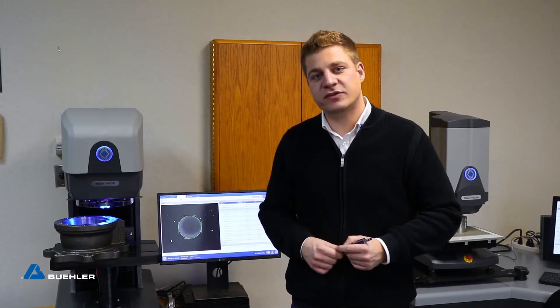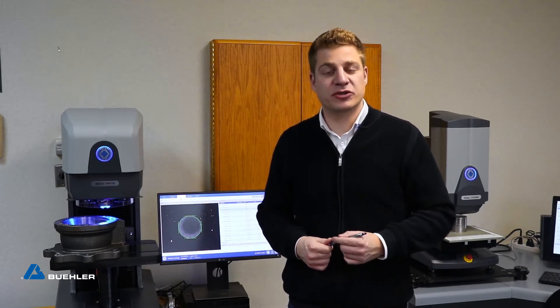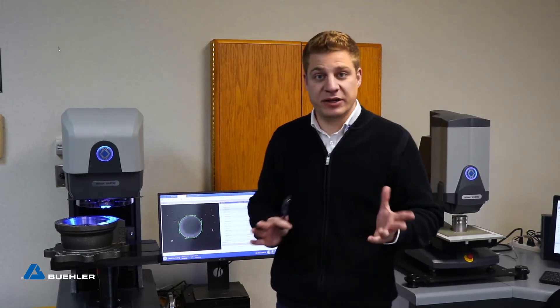Here we are in our hardness testing lab where we do product testing, software testing, customer demonstrations, as well as trainings and many things more.